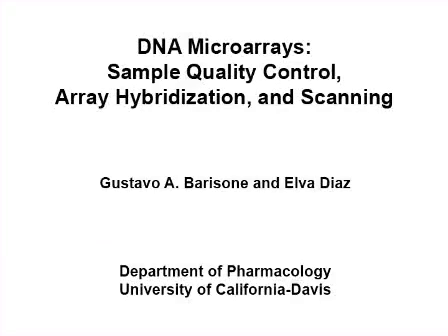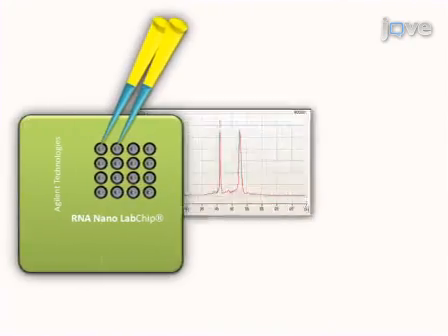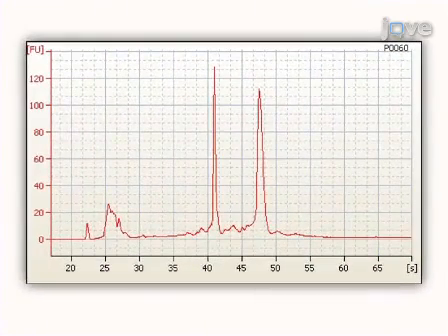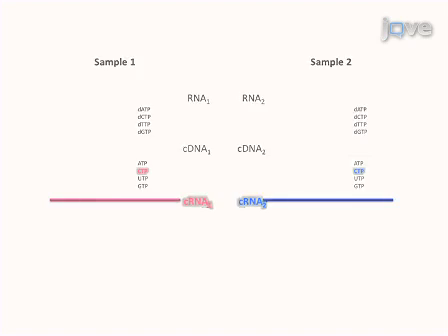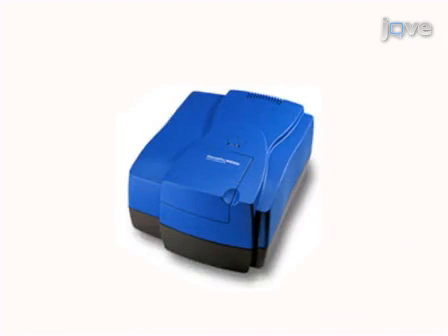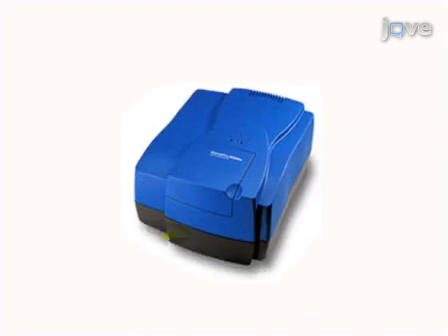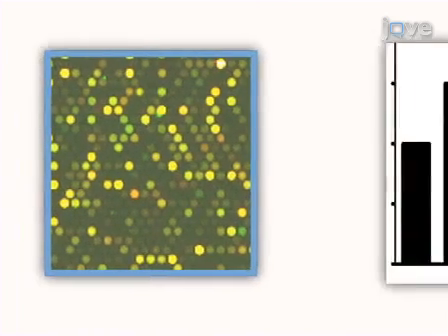The overall goal of this procedure is to perform a microarray experiment using an automated mixer apparatus. This is accomplished by first analyzing the quality of the RNA samples with the bioanalyzer. Subsequent to RNA amplification and labeling, the RNA samples are hybridized to the microarrays. Finally, the hybridized microarrays are washed and scanned. Ultimately, results are obtained that show the differential expression of RNA transcripts through analysis of dual color fluorescence microarray images.